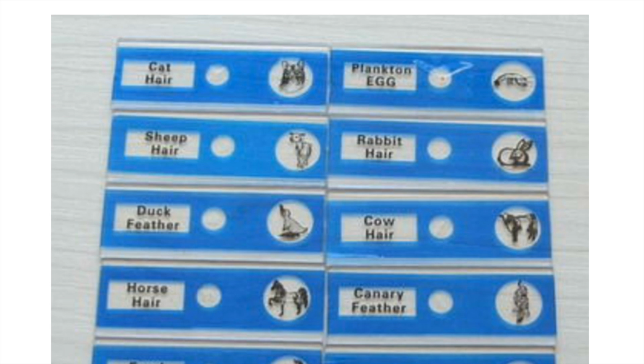This is a little bit blurry, but here are some prepared specimens, and the specimen is always in the center of the slide. And here you can see that this is rabbit hair that would be in here, cow hair, canary feather, just to give you an idea of the different kind of slides that can exist.